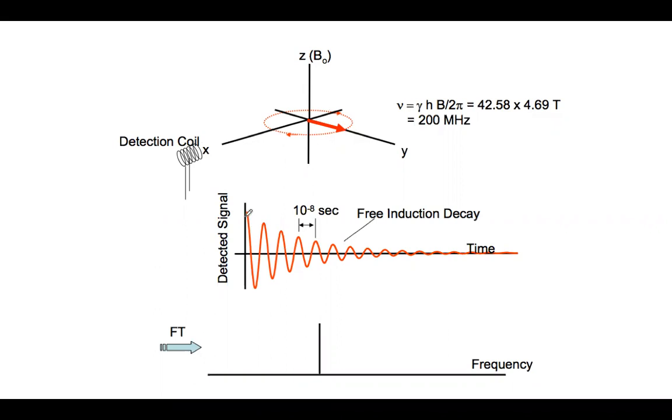And then this is kind of like the pulse of a Fourier transform radio frequency. So what's happening here is we're detecting a signal. Oh no, sorry, this is not the Fourier transform.